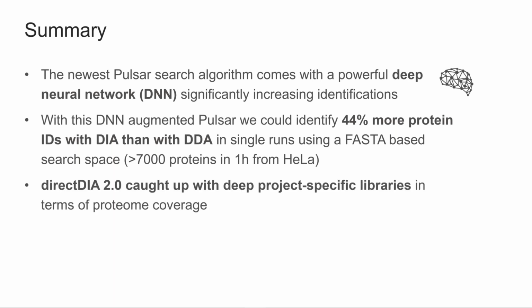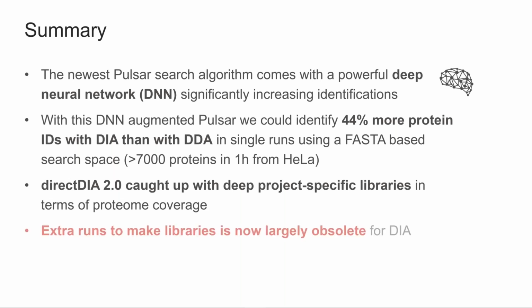Then what I showed on the last slide is that DirectDIA now caught up with deep project-specific libraries in terms of proteome coverage and also quantification. And in the end, this essentially renders extra runs to make libraries largely obsolete now for DIA, which is really great.